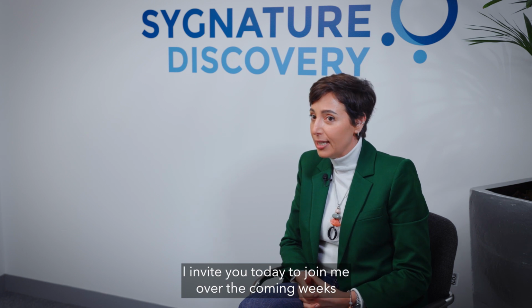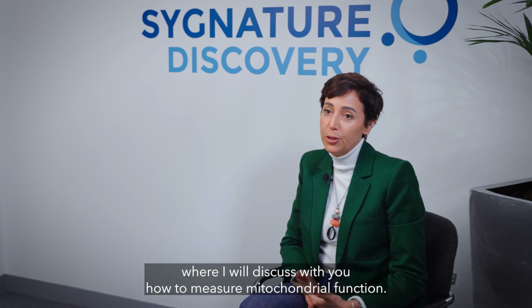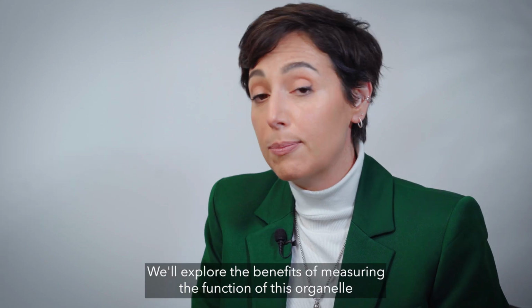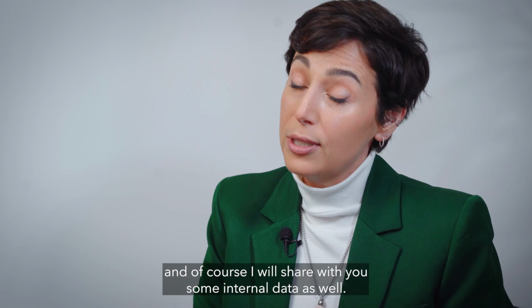I invite you today to join me over the coming weeks, where I will discuss how to measure mitochondrial function. We will explore the benefits of measuring the function of this organelle, and of course, I will share with you some internal data as well.